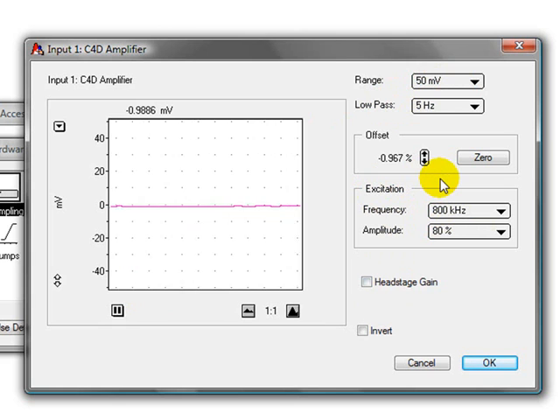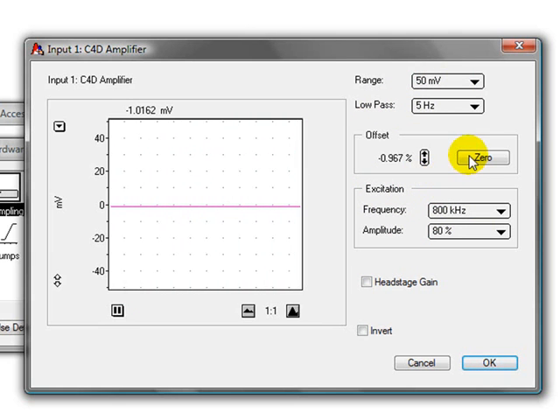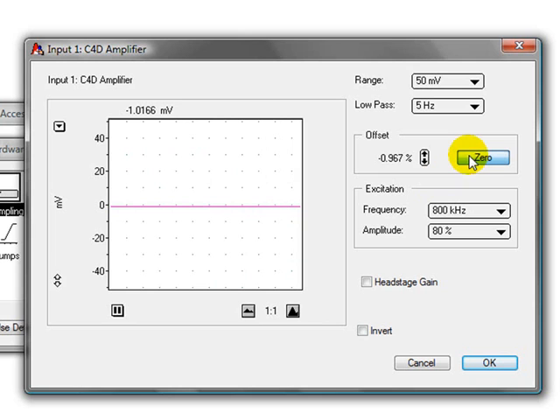You then inject your background electrolyte into the capillary and click zero to zero that signal.